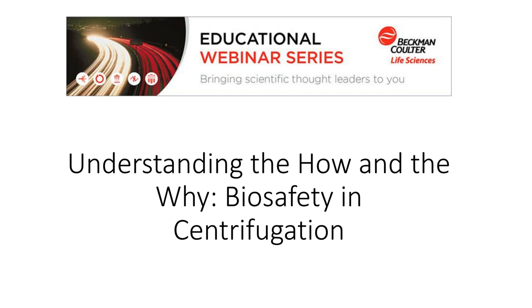I'm assuming most of what you're doing is aqueous. So your first solvent's going to be water, possibly followed by the 70% alcohol, and then maybe you're disinfecting. The other thing the alcohol will do is help things dry a little faster, so I'm calling it just kind of speeding up the drying step.